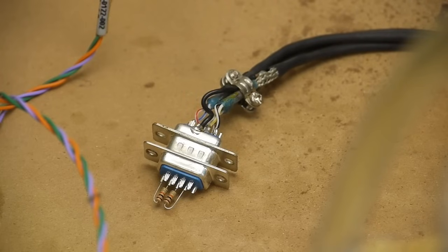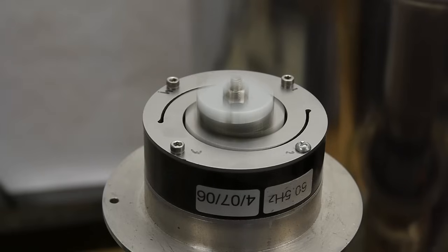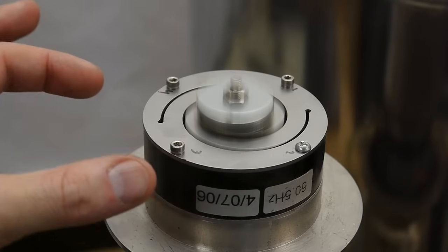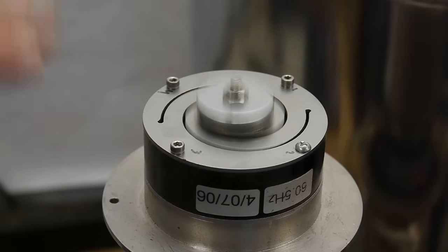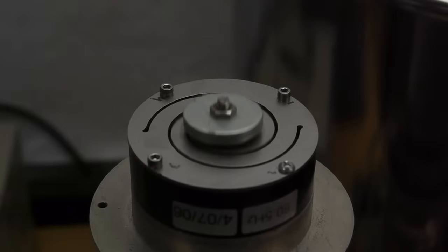The cryo cooler has this passive spring-loaded counterbalance on the back. Since inside the cryo cooler there's a piston that's moving up and forth the whole thing would shake wildly if it didn't have a counterbalance. So there's a spring-loaded set of weights up here really just washers and the weights are set up, you can even see they marked at 60.5 hertz to absorb that frequency being generated by the piston inside. I thought I'd play with the camera shutter so we can see what this thing looks like sort of going in and out of phase with the camera's sync rate.